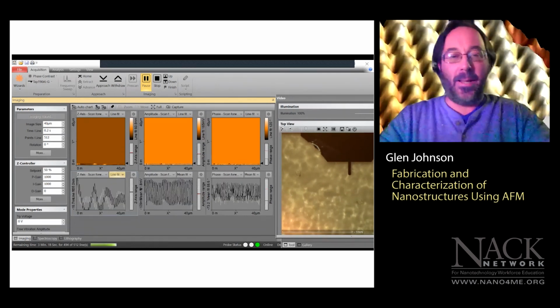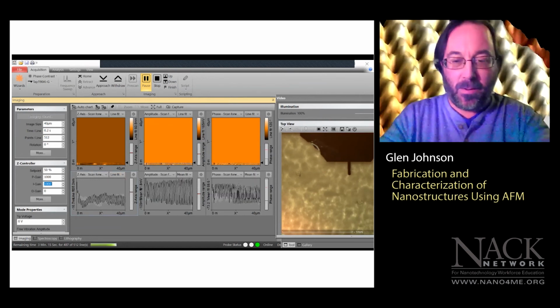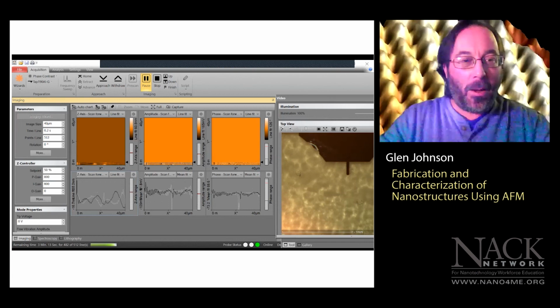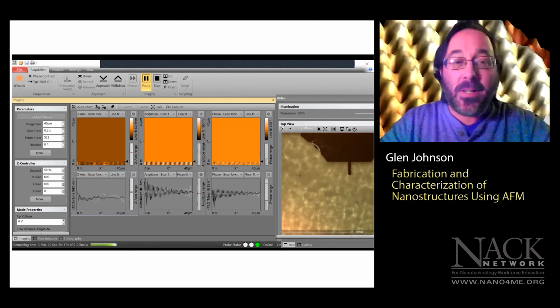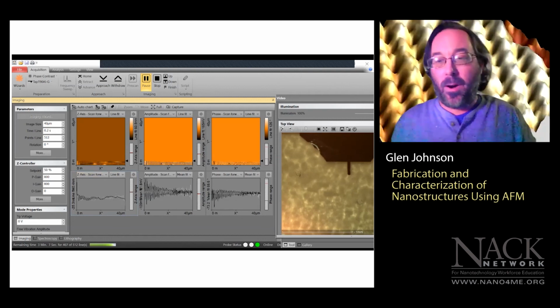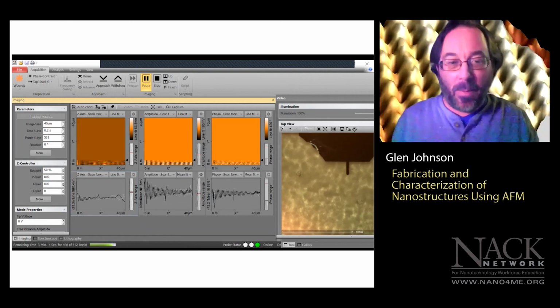So as this scans, well, it's looking really rough. We'll see if we can make this look better. As this collects its data, I want to point out that on our topography, whatever is brighter is higher. So even if I'm not on an area where I etched out that pattern earlier, there's still debris on this.